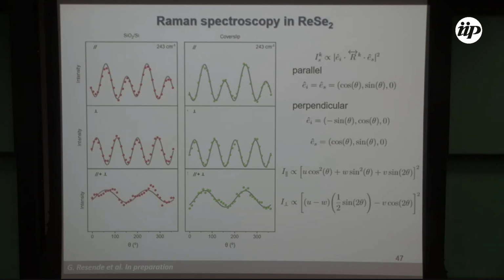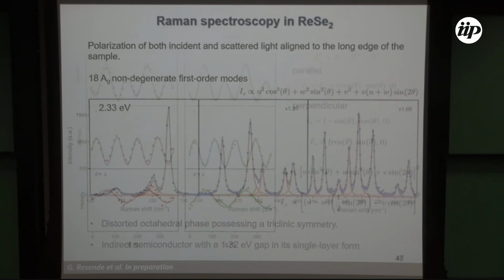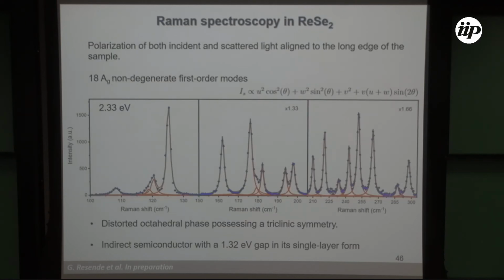And as an additional issue, we know that there are interference effects from the substrate. Since we want to study and understand how these peaks behave when you change the angle, it is important to see as well if the substrate is influencing our spectrum. So we prepared 2 samples. One was on silicon and silicon dioxide, and another one was on glass, a cover slip. And this is the position for one of those peaks, which is this one over here, okay?